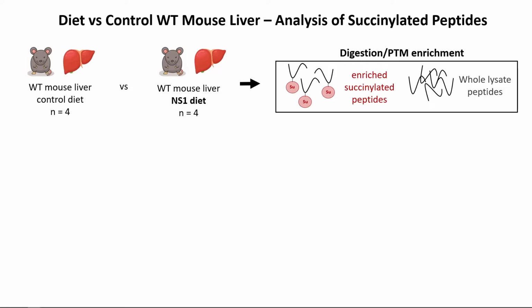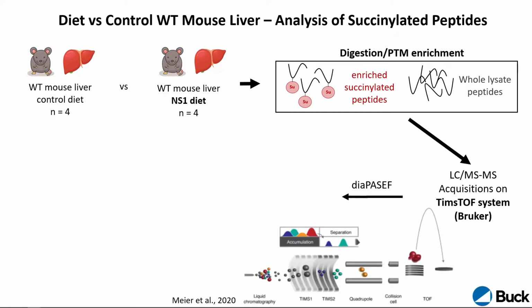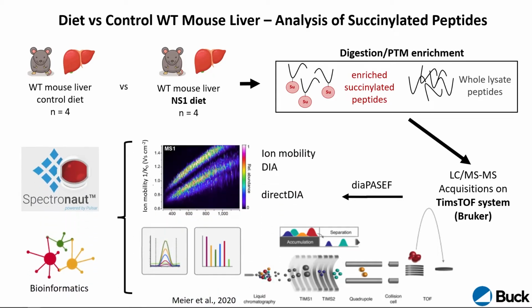And so we just recently did some work with Bruker, using their DIA-PASEF workflow. The other work I presented earlier was done on the Eclipse, and this is now done on the Bruker timsTOF, having the extra ion mobility space to reduce complexity. Anything reducing complexity is good. And then we basically run all this again through Spectronaut in the workflows I showed you before.